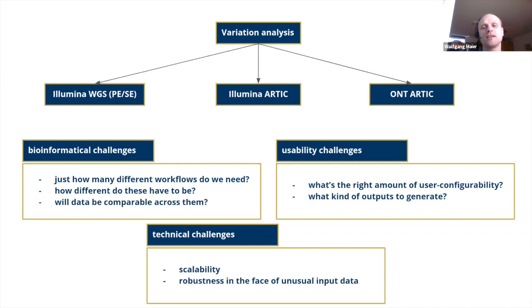And then another issue are, for example, overlapping indels, because indel calling is never as accurate as single nucleotide variant calling. You might have just slightly different indel boundaries for the same ref allele. And again, what does your workflow do then? Will it be able to cope with that when trying to report those?